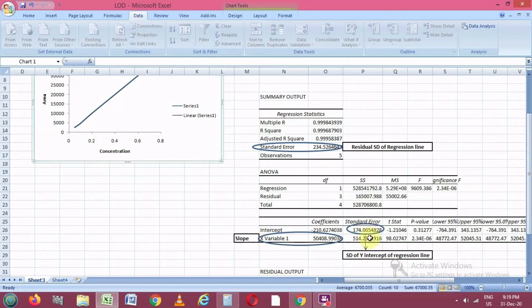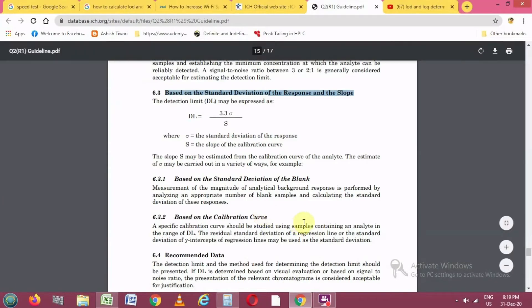You can now see all the regression values related to these concentrations and areas. The key value here is the Standard Error — this is the residual standard deviation of the regression line. The slope value is also visible here, listed under the variable row.